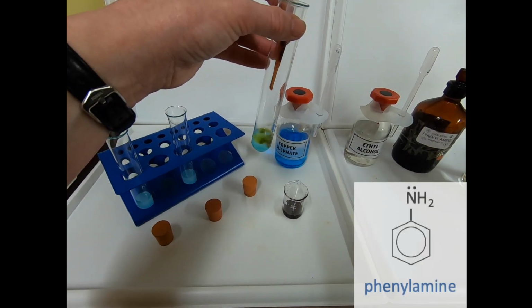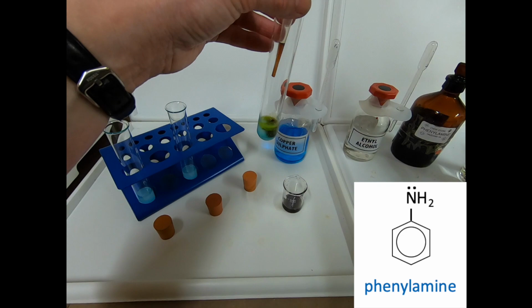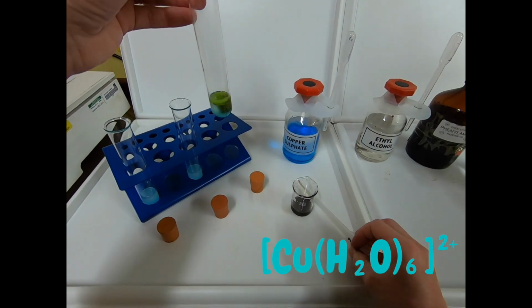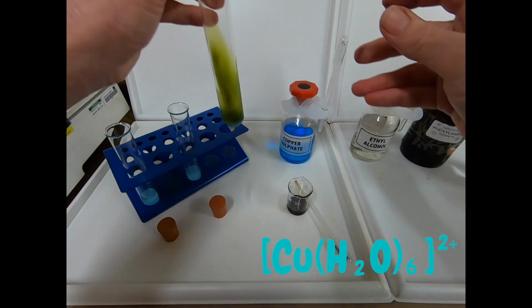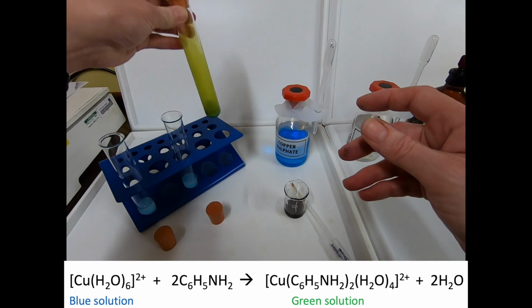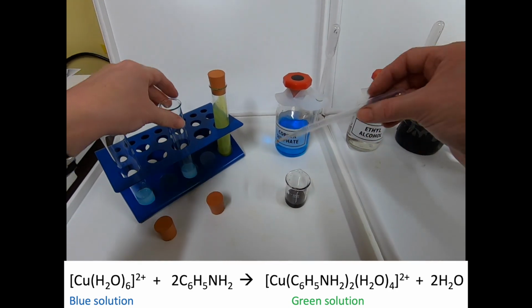Our first substitution will be with phenylamine and the hexa-aqua-copper 2 ions in the solution. You can see the solution changes from blue to green when it is added. This is because the ligand replacement reactions have occurred.